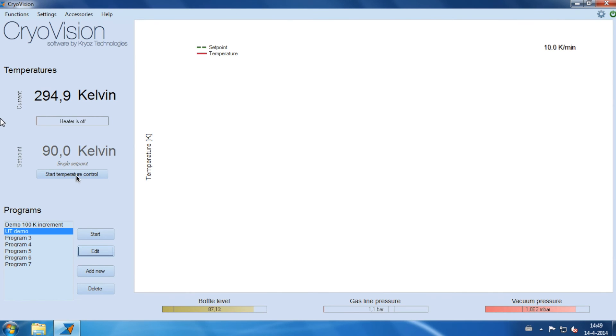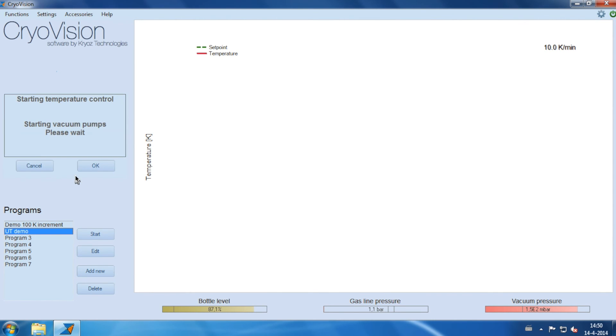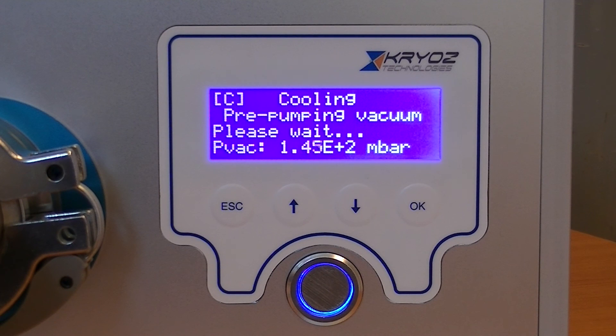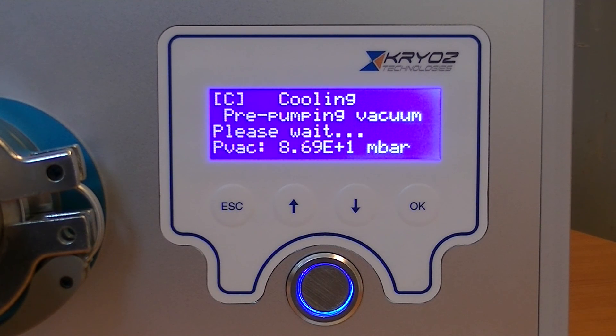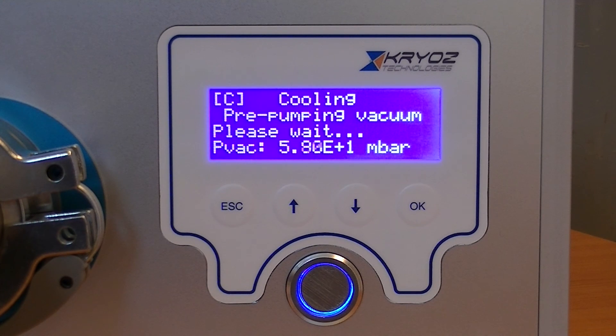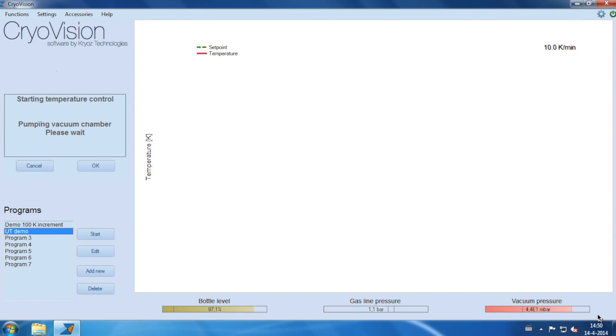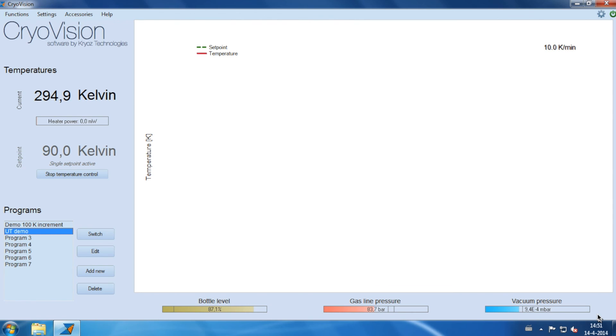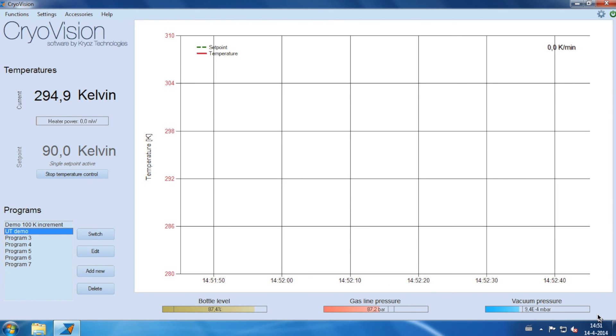To cool down your loaded sample, click the start temperature control button. The system will start by evacuating the vacuum chamber. All monitor data is fully synced between the hardware and software. Pumping down to a pressure of 10 to the power minus 3 millibar takes about 1 minute. At this vacuum level, the system starts pressurizing the stage, which initiates cooling.